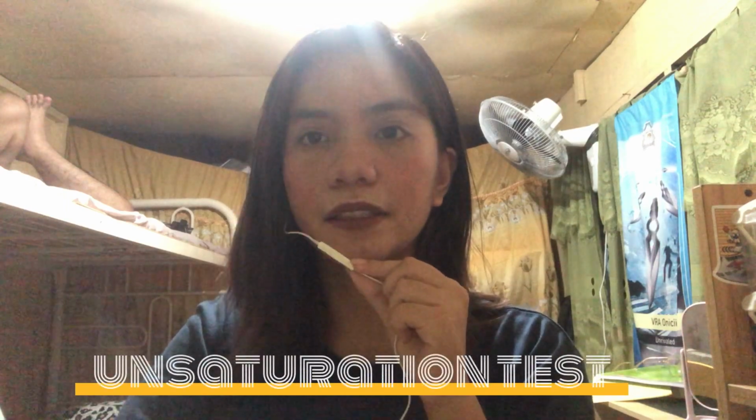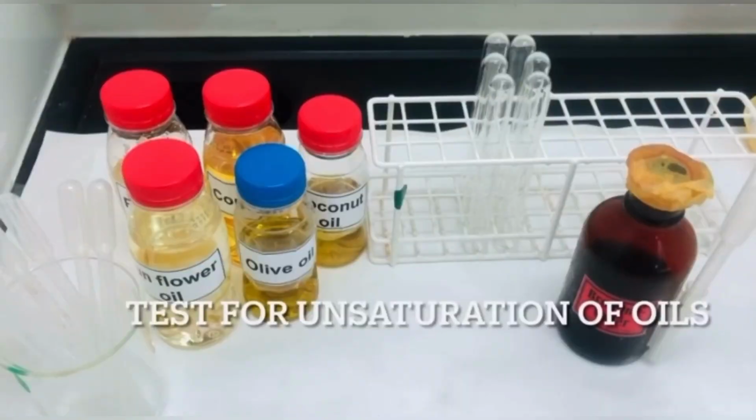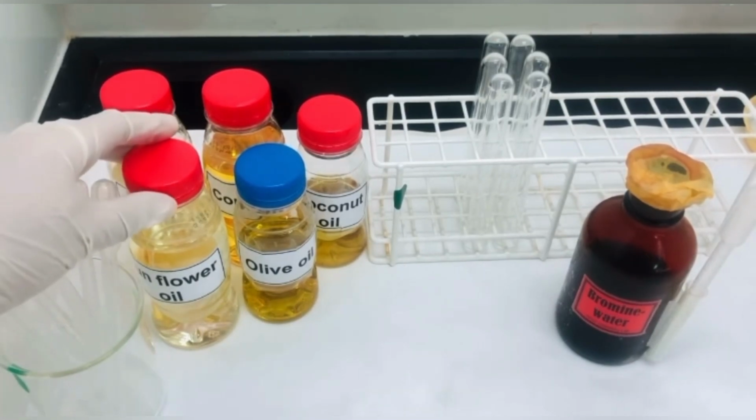Next experiment, we have the unsaturation test. In this experiment, we will be able to determine the presence of unsaturated fatty acids or double bonds in a sample of lipids. So let's get into it. What we are going to do today is about determining unsaturation in the given oil samples. We are using the oil samples.